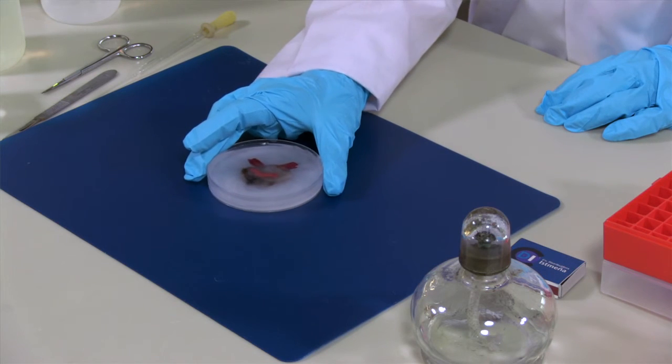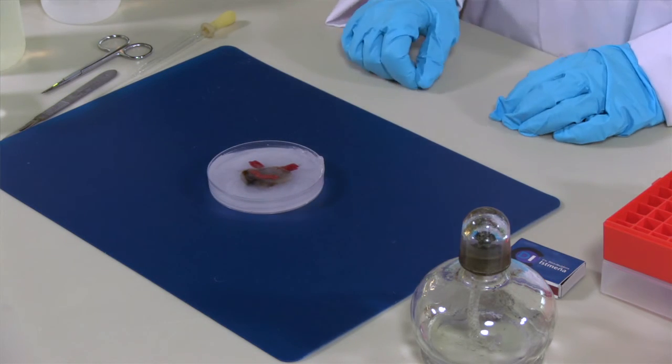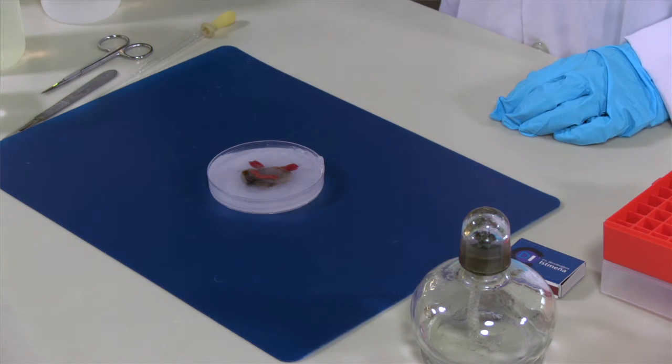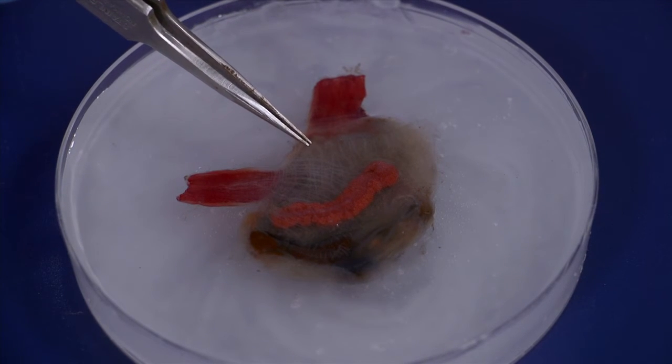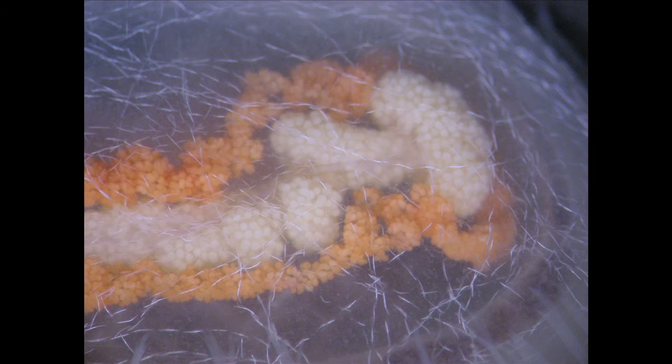This animal here is from the genus Herdmania. It's a solitary ascidian already dissected without its tunic. You can see that on the body wall there are lots of needle-shaped spicules — they look like small white threads accumulated on the tissue, and the long white threads underneath them are the muscles. In this picture you can see that they also accumulate in the whole body wall. Although these spicules are larger and you can see them under the dissecting microscope, it's always good to make preps for the scanning electronic microscope to see details.